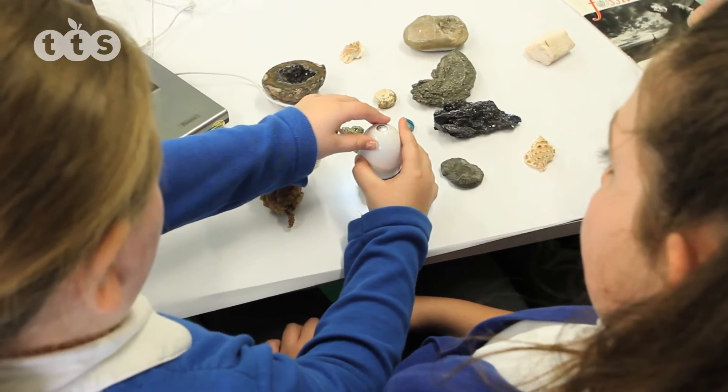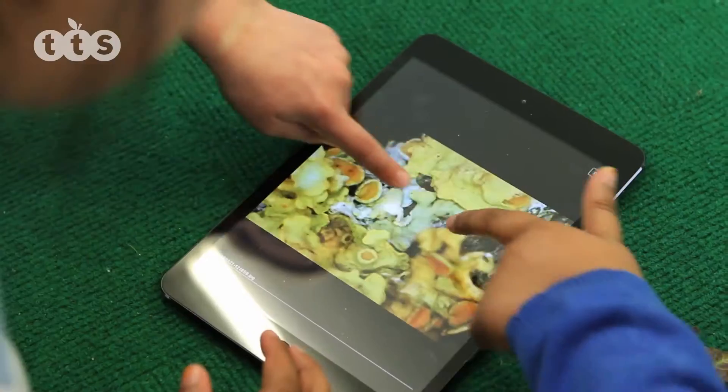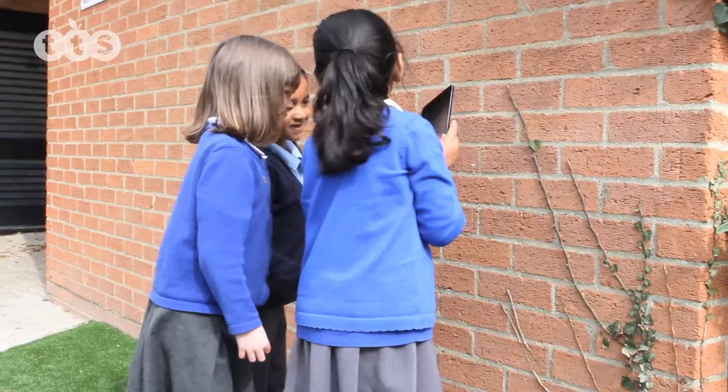Unlike using a conventional microscope, images being studied remain unharmed and can be discussed and identified with clarity. The EasyScope Digital comes with rechargeable batteries.